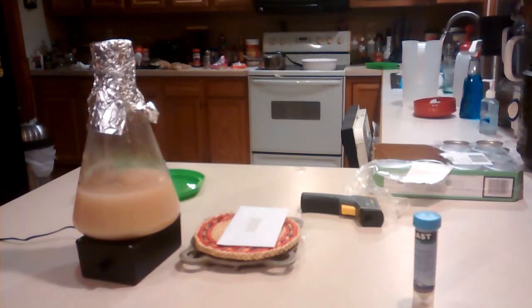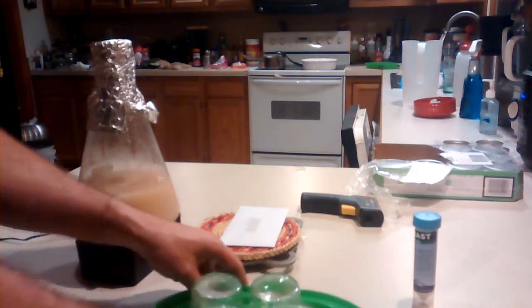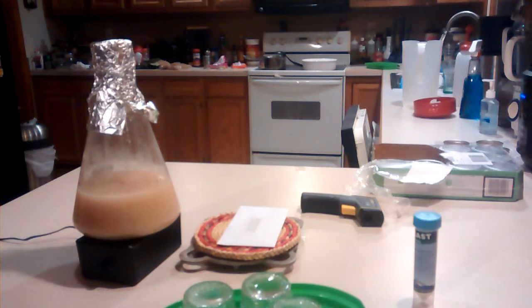Hey, it's brew day. Time to finish dealing with the yeast. I'm going to put some together for storage for later in the year, and also leave myself several hundred milliliters to throw into the fermenters. So for starters, I think we'll just get it poured into these sanitized 4-ounce mason jars.